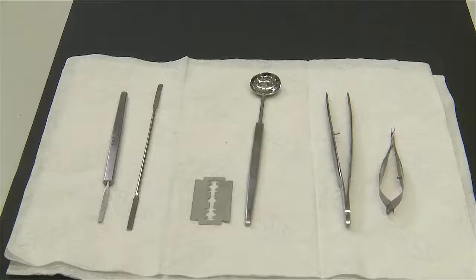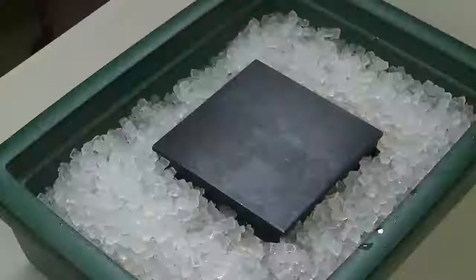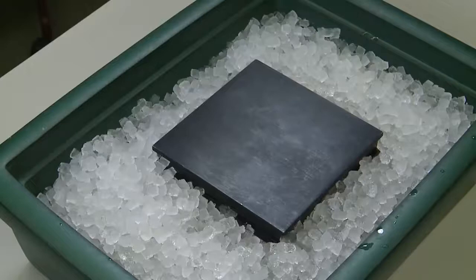Hello, today I'm going to show you how to dissect out the hippocampus from the adult mouse brain. For this you will need a razor blade and a perforated spoon, and depending on your dissection preferences, you can have two dissection spatulas or a forceps and a micro spring scissors. You will also need a cold surface on which to dissect, such as a pre-chilled metal plate sitting on ice. For subsequent RNA extraction, the dissection surface and tools should be cleaned with an RNase decontamination solution.